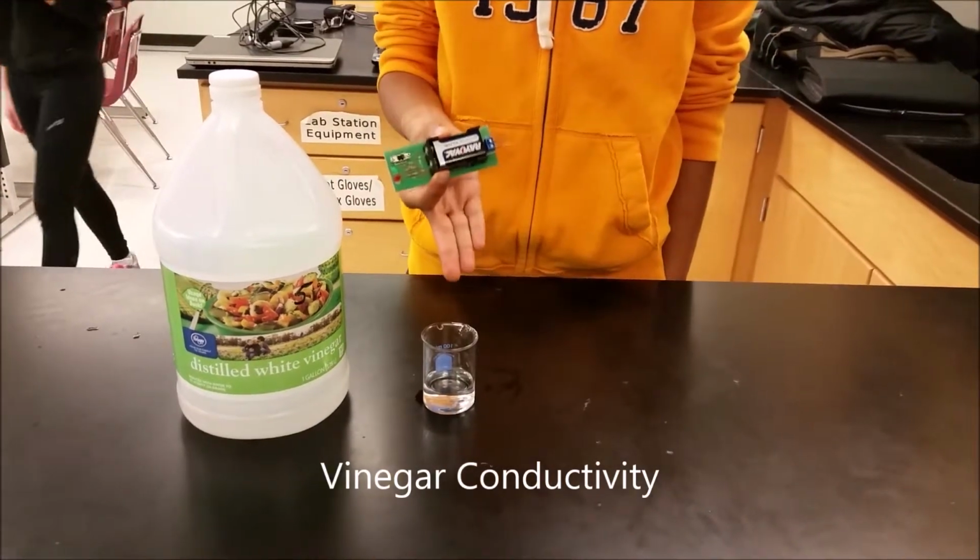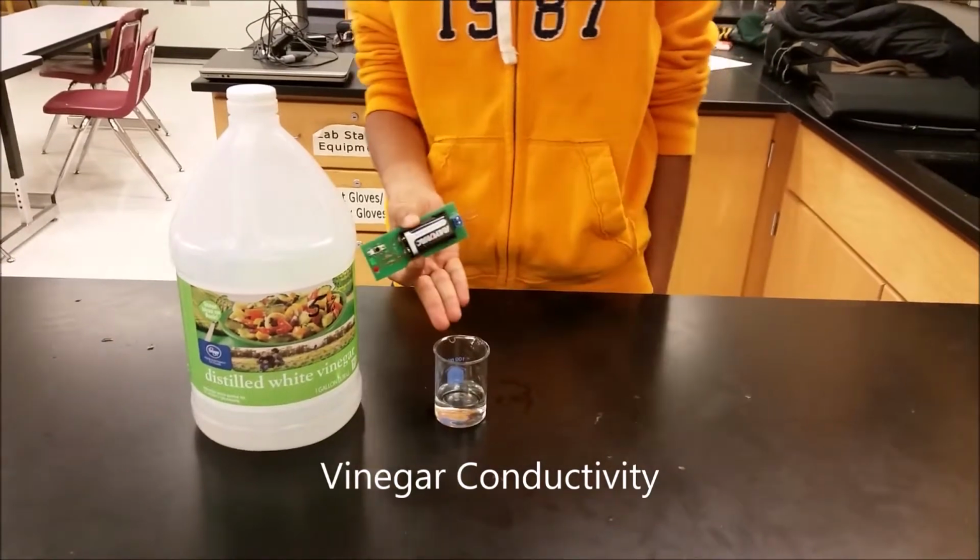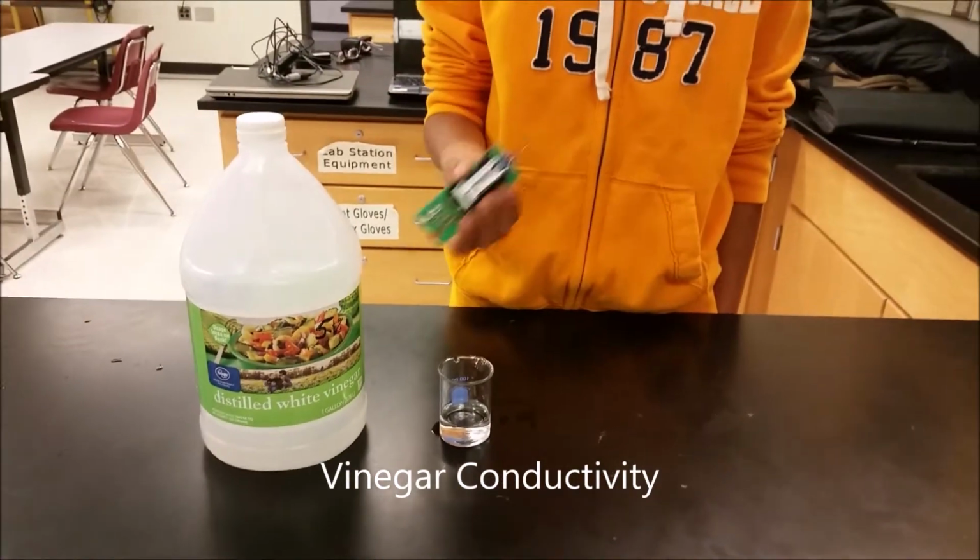Vinegar, we again have 40 milliliters of it with the 0.1 molar concentration in this beaker right here, and we're going to again test it for conductivity with this probe.